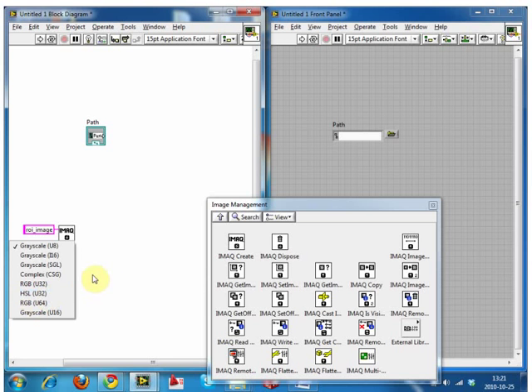So how could we know the quality of the image? What kind of image maybe? Like I was telling Eric, basically you're only ever going to use U32 or 8-bit grayscale. You don't have any cameras other than the Andor that do anything else. There might be specific examples you come across and you'll have to adapt for them, but none come to mind. If you're using a color camera, it's U32. If you're using a black and white one, it's 8-bit grayscale.